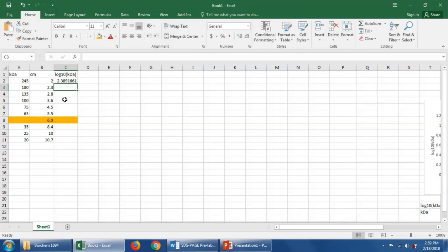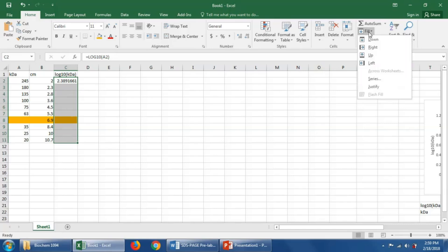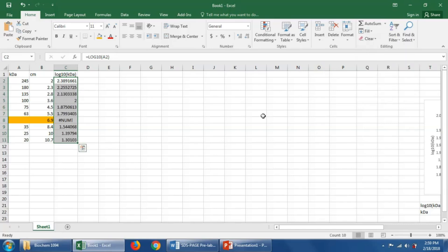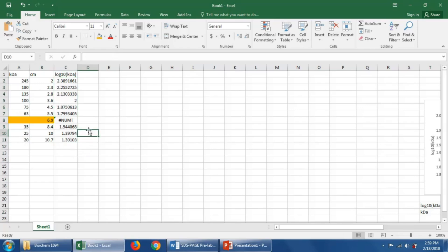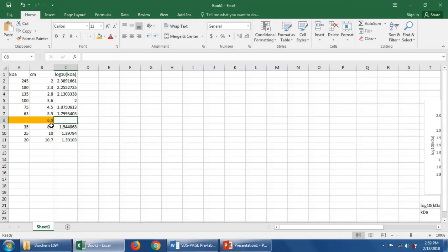We don't have to do this for every one of the calculations in this column. We can instead highlight all of these columns here and go to fill down and Excel will calculate the comparable calculation for each one of these molecular weights in kilodaltons. It put an exclamation point here because we didn't have a corresponding kilodalton here. So I'm going to delete that. That is what we are trying to find out here.